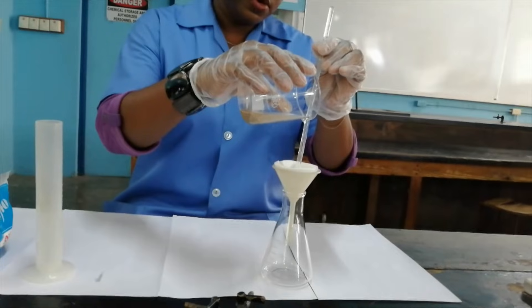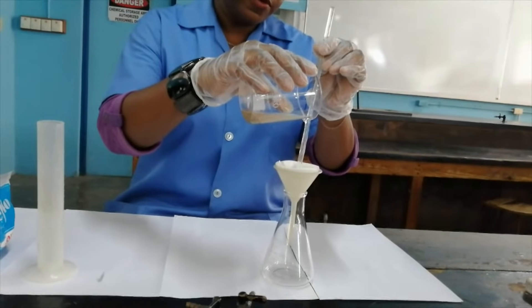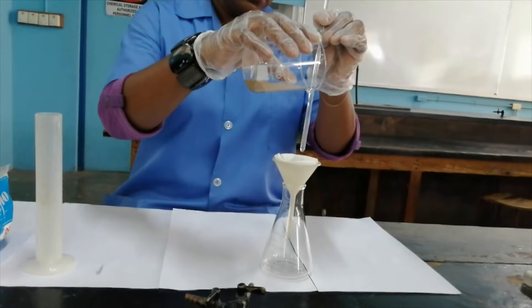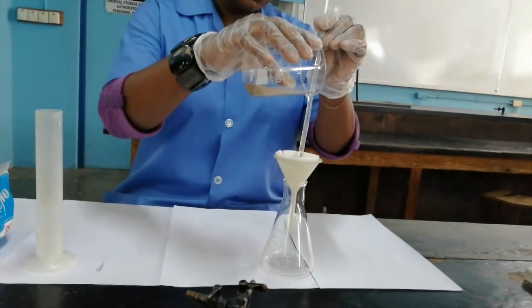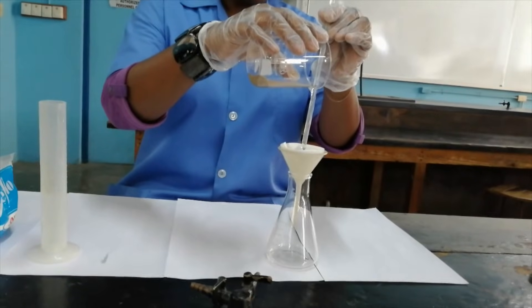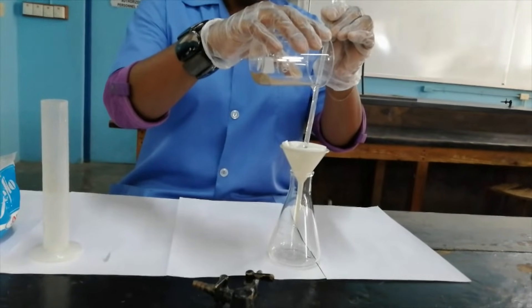What I'm doing now causes a more controlled flow, so I'm directing the flow of the liquid into the filter paper, which is of course inserted in the funnel.